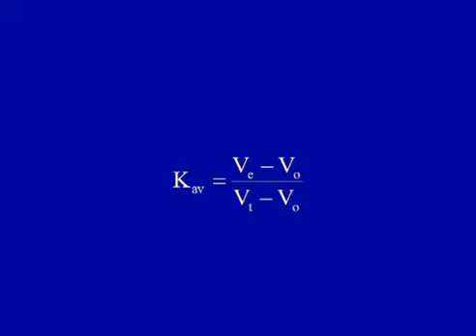A total bed volume can be measured by determining the elution volume of a small molecule that is not in the fractionation range, like salts or acetone. They could be utilized since they have complete access, they can easily move in. So, they just move with the mobile phase, and they spend the most time, and the elution volume could be calculated by utilizing a very small molecule.